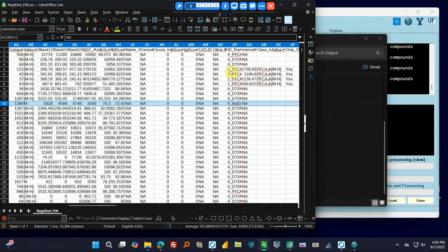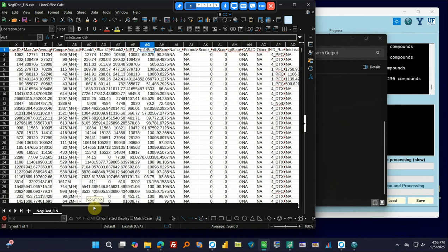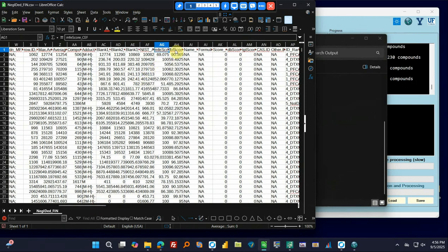You'll get your FluoroMatch identifications as normal, and then your peak areas or peak volumes are going to come from the PFA file itself. So these are from Agilent's peak picking, and then you do get some of the Agilent metrics alongside that can be used, and you can use these in the visualizer as well, which we can discuss in a future video. So here's the MFE score, find by formula score, any identification.